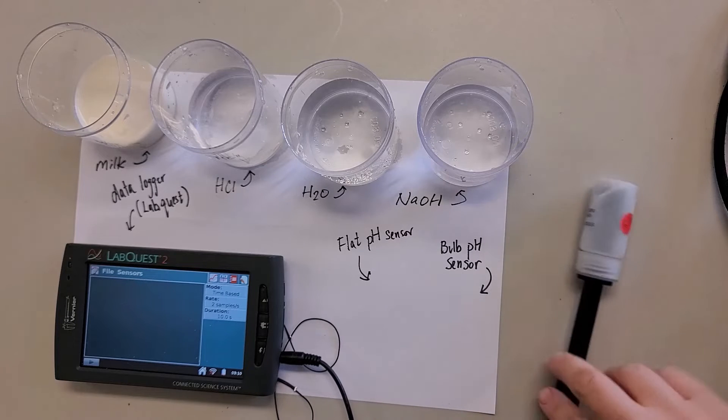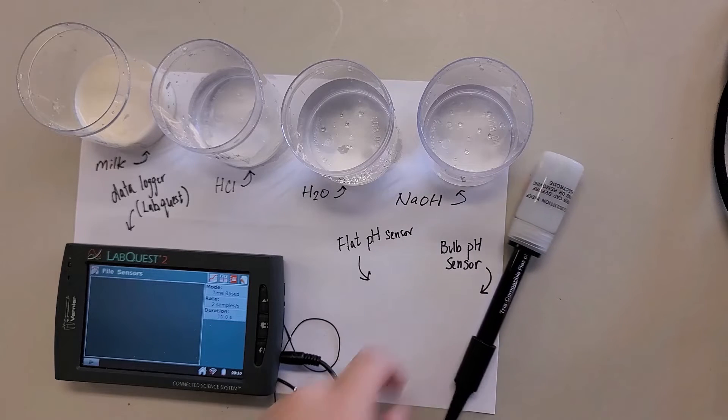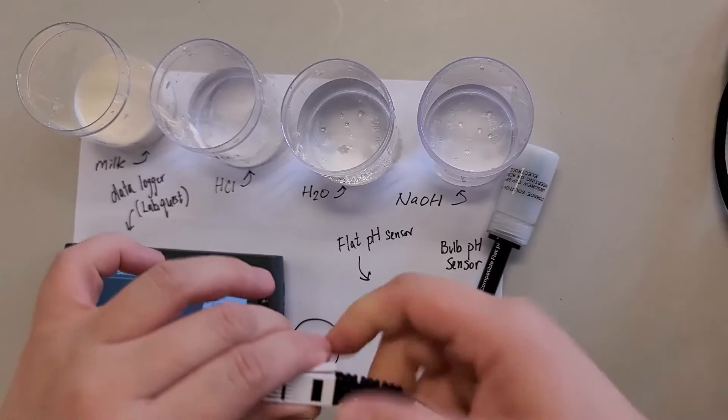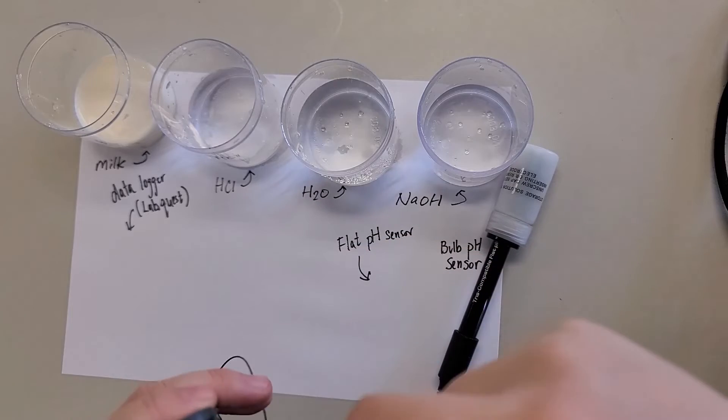So here, what we're going to do is try the milk first. We will use the flat pH sensor. Press this one before you put it into the channel, channel one.